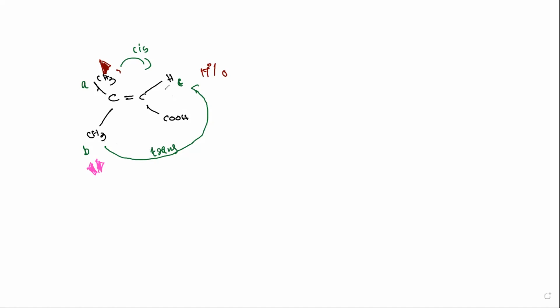So this method is useful to determine the stereochemical relationship in the molecule.